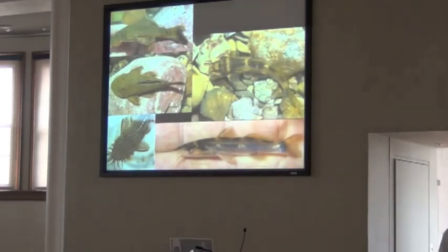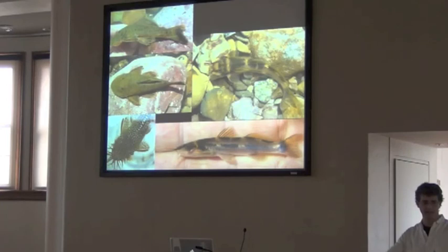If you're not shooting in the squeeze tank or in a bucket tray, just use your surroundings if the water's clear enough. These are streams coming off the Andes — really clear headwater streams. You're just sticking the anesthetized fish in the water and getting these natural backgrounds. Or in this case, my hand — just putting it in the bucket and getting a quick shot. For a lot of these fishes, the water causes the fish to naturally extend its fins. If it has barbels, they will be naturally extended as well. As soon as you pull it out of the water, the fins fold and you lose the barbels. That's the reason for taking these shots in water.